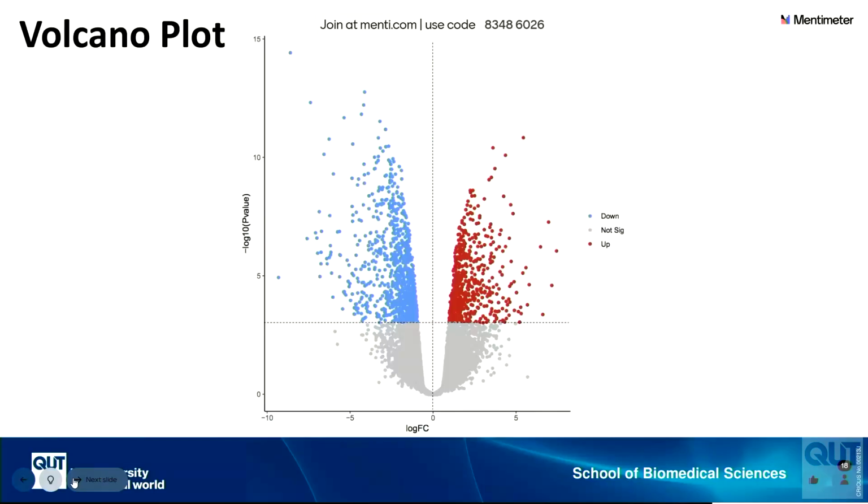Exactly. It is the line at which your sample is either significant or not significant. So then you can easily tell how many samples you've got in either direction, either increasing or decreasing, is significant. And that's why I love a volcano plot, because it lets you look at all these different genes, all these different samples, all at once, and is able to show how many are significant versus how many are just sort of middling or boring.